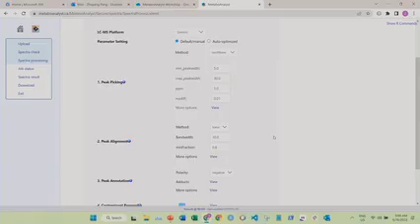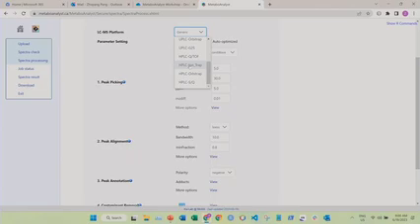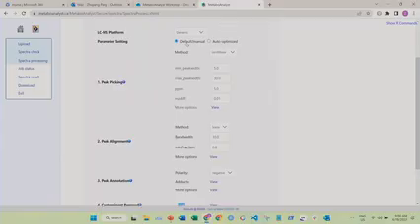Here we provide users two options. They can select different parameter settings that have already been embedded in our server, and they can use a different mode. The first one is the default. They can use the default parameters, or they can manually change whatever parameter they want to change, if they are an advanced user, they really understand the meaning of different parameters, or they have some experience with these parameters.